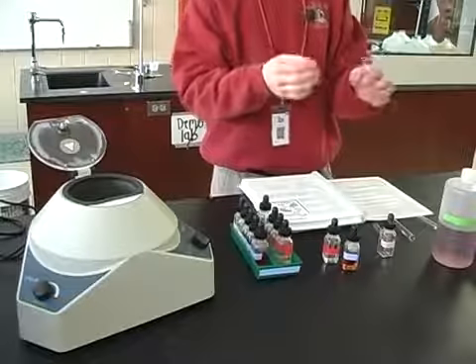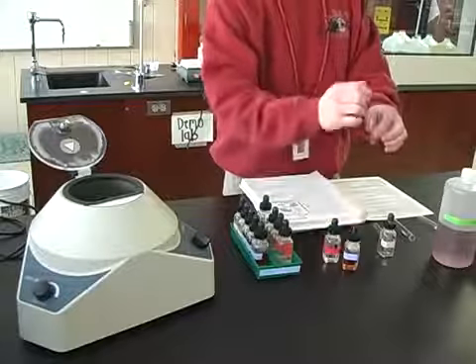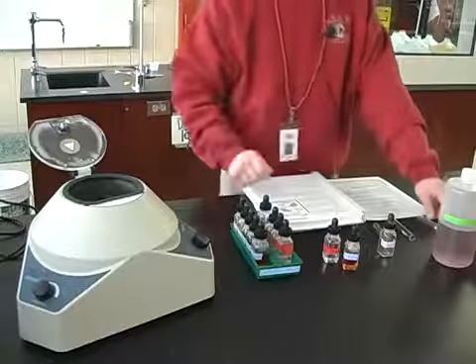You'll contaminate your solution. So make sure to put the test paper down here, dip your stir rod in, and then touch the test paper.